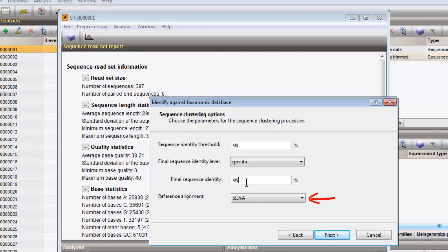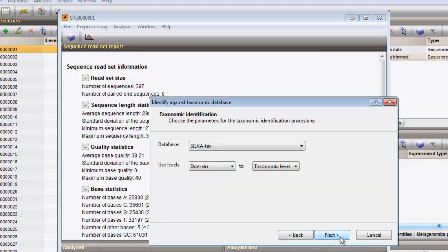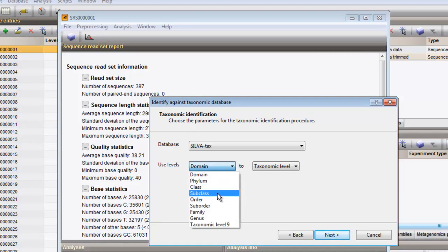And finally, the reference alignment should be defined. Once the clusters are calculated, their sequences are identified against a taxonomic database. In this page of the wizard, the taxonomic database can be selected and the analysis levels can be specified. We will limit the identification levels from bacterium phylum to genus.